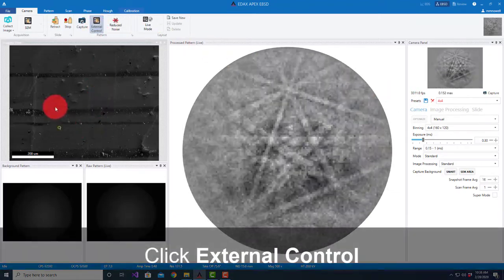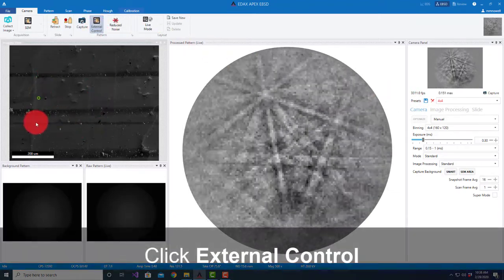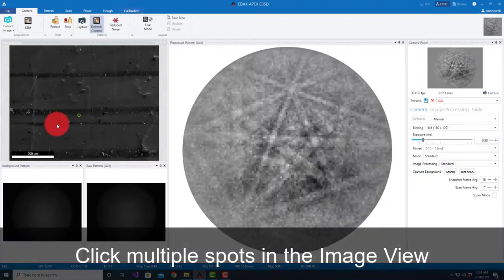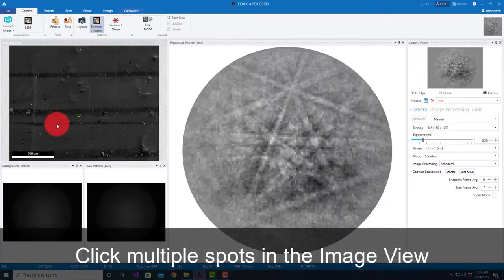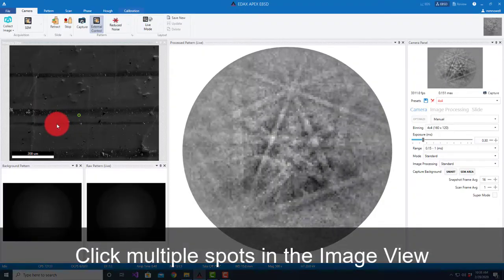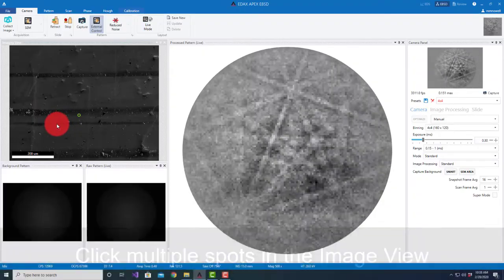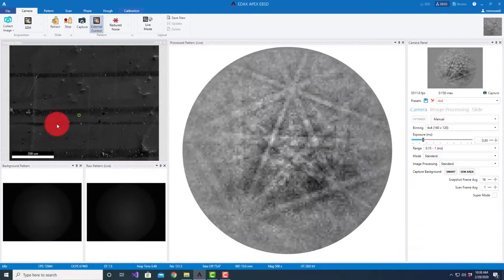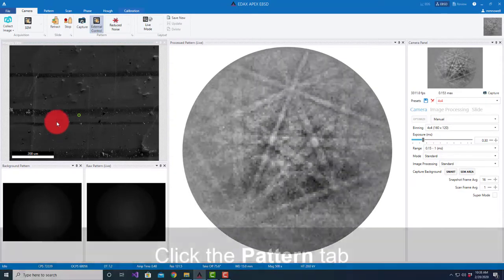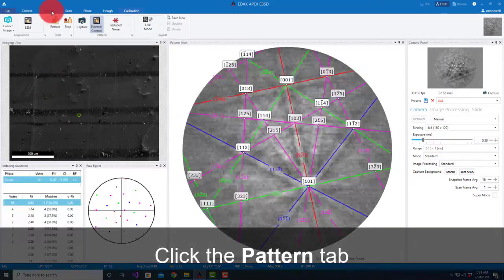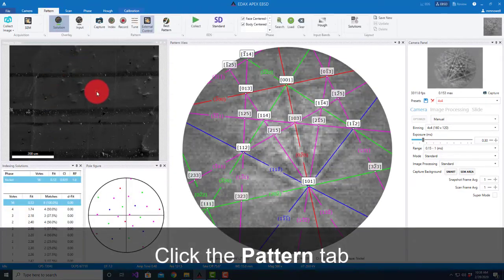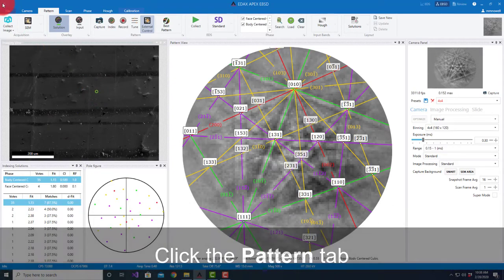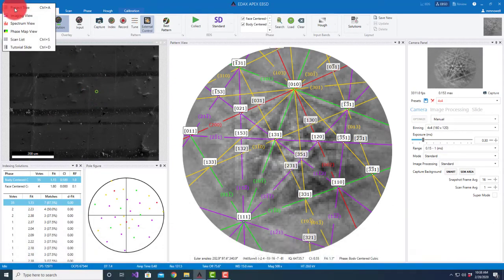I'm getting a decent pattern quality. I want to go relatively fast for combo scan because the purpose is to look at multiple fields and then stitch them together to look at a large area.